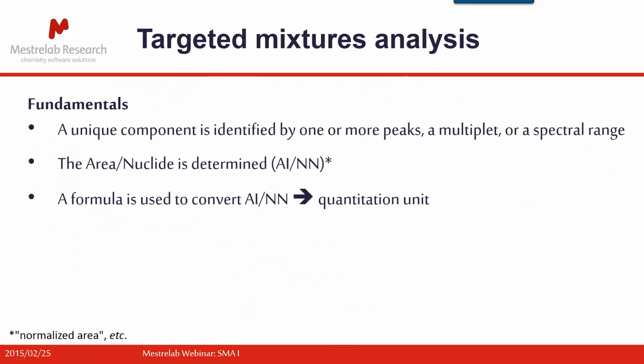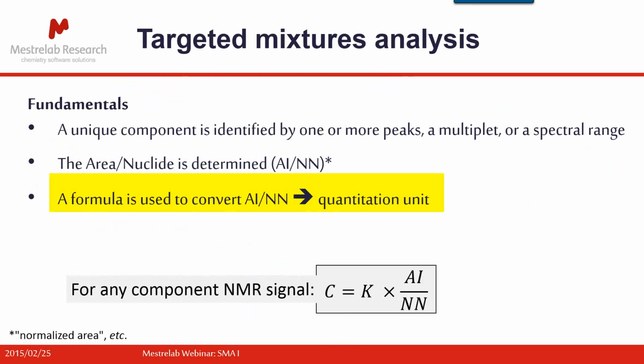We then need to be able to relate that area, that normalized area, into some sort of quantitation unit, and that requires some sort of formula, and I'll say a little bit more about that in a minute. So that's that there, giving some emphasis to that need for a way to convert that.